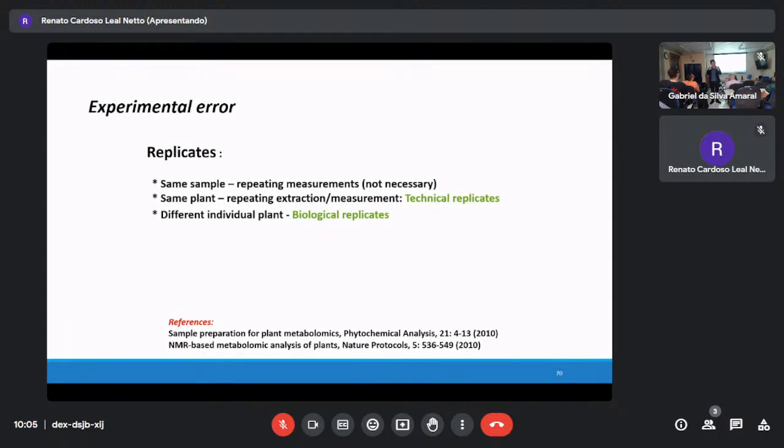Let's keep in mind: how many biological replications? If it's a non-controlled system, you need more. If it's a controlled system, you need fewer. This is important. Technical variation is how much we can trust your technique. So depending on the measurement, you can choose how many cases. Usually, biological variation is much bigger than technical variation. Otherwise, you don't have any reason to use that technique. Right?